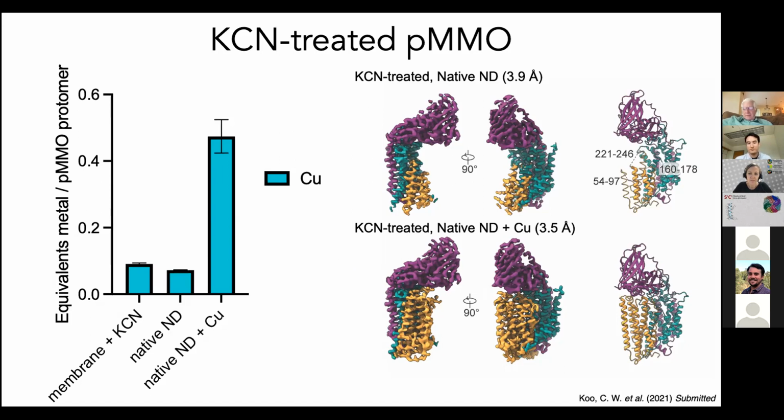Okay, and I don't know the acronym, but SMALPs might stabilize more than detergents. Yes, we are exploring that extensively as well. Coming from someone that's handling nanodiscs quite a lot, the SMALPs are very nice because they do everything I'm trying to do in terms of reconstituting native lipids. We've hit a roadblock where we're not getting activity from them, so they might do too good of a job of isolating out of the membrane. But that work is still ongoing because the SMALPs are really fascinating and would be a really good tool for this as well.